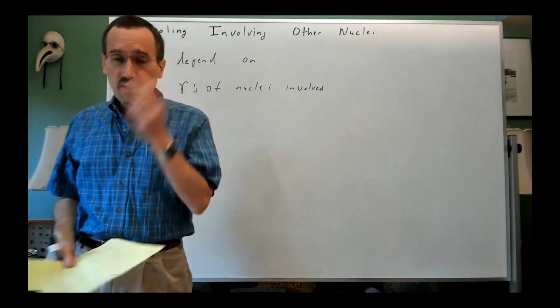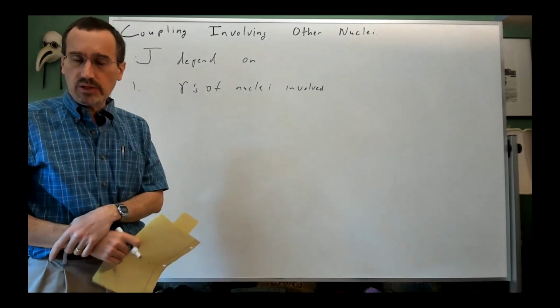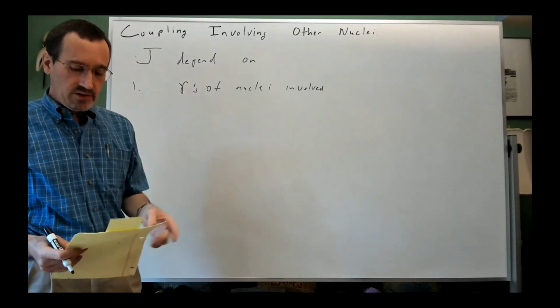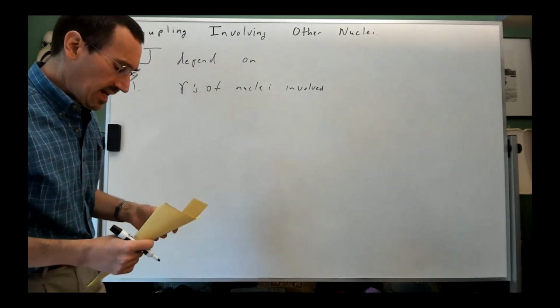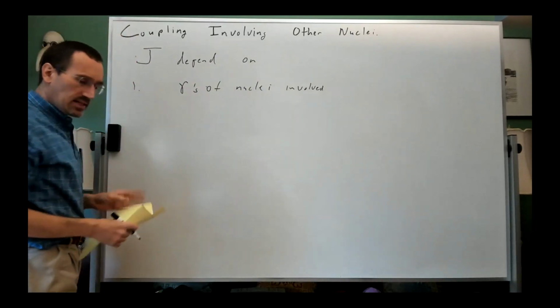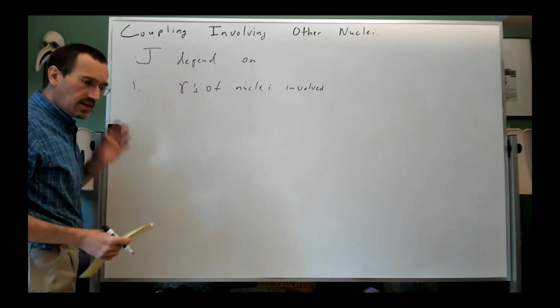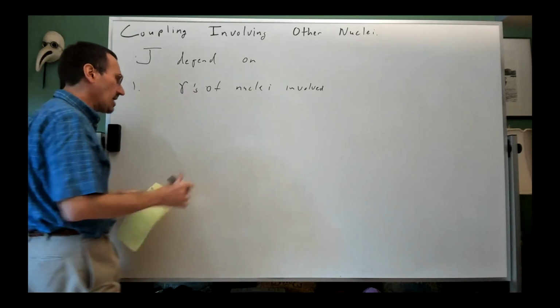So in general, if you have a bigger nuclear dipole, or in the case of deuterium, nuclear quadrupole, you're going to have bigger splitting. And we've already talked about one example of this, and it was kind of an interesting example when I presented it. I'd like to present it again because I think now we can really appreciate it.